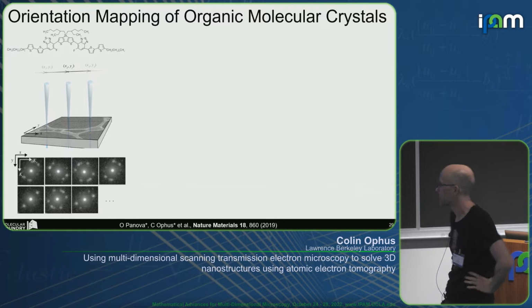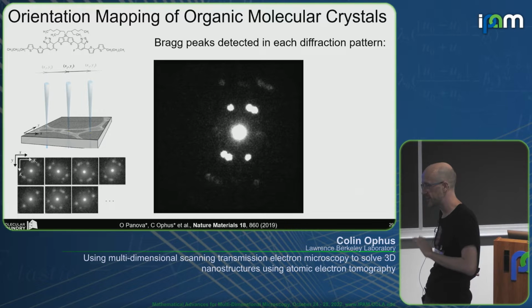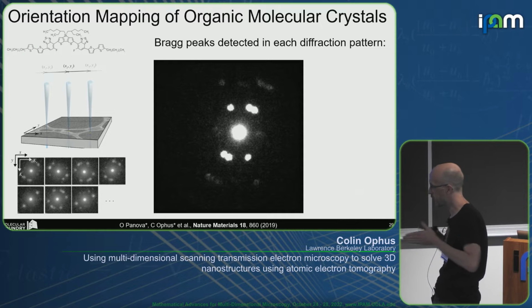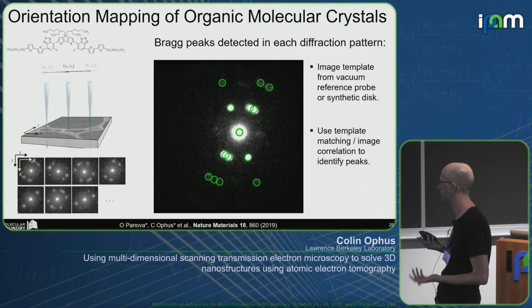Yeah, so I just wanted to show one other orientation mapping example, ultra-weak diffraction from soft molecules here. Here, we can get basically no diffraction spots except for the pi-pi stacking, the sort of polymer-like backbones of these small molecule soft matter samples. You really have to blow up the contrast to get the diffracted peaks.